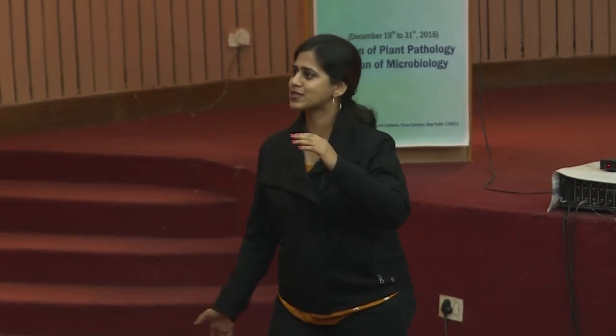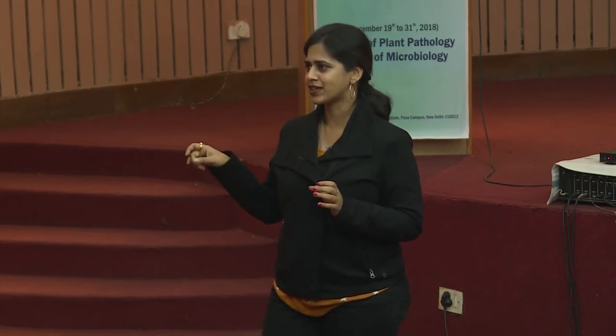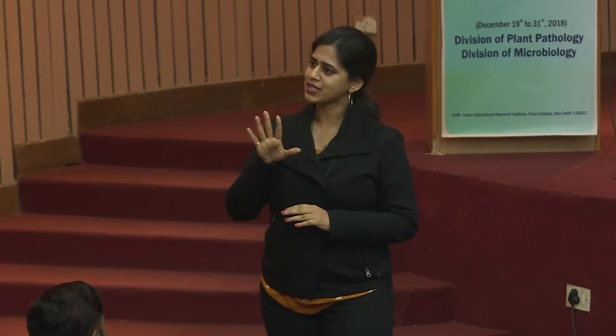That's a cutoff, 20x, but I don't mean that all the SNPs will be of 20x. Everything will be somewhere around 50, 60, 70x in the SNPs. But that's a cutoff. I will not call an SNP anything below 20x, because there will be some random errors. Exactly, it should not be called an SNP. Those will be eliminated by the tool itself.